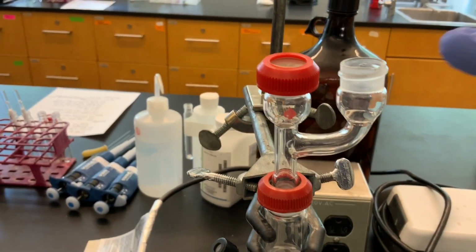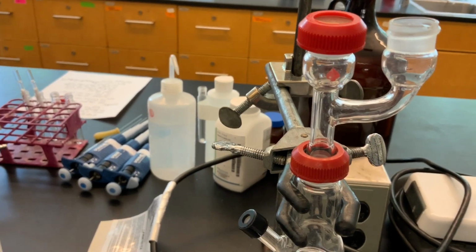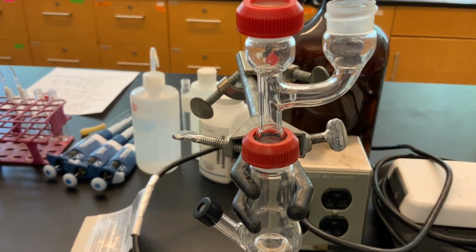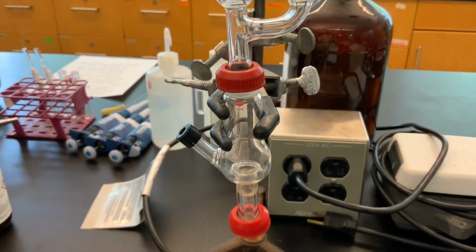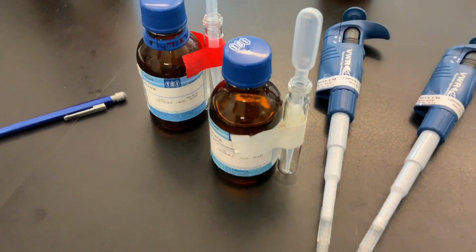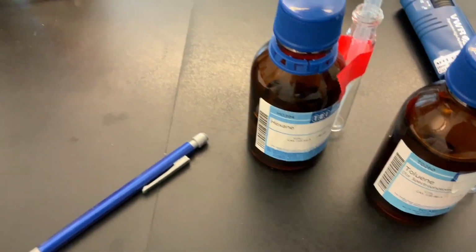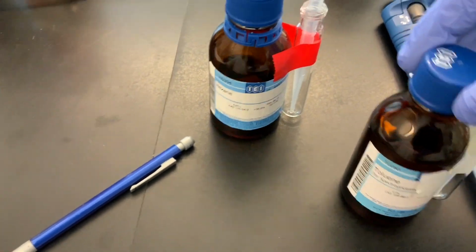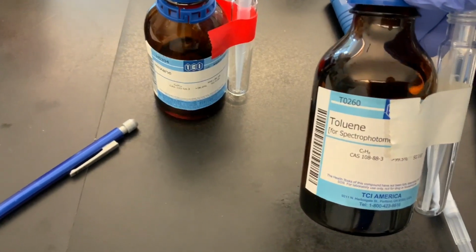The sidearm of the Claisen adapter will be left open to the atmosphere because, of course, we would never want to heat a sealed system. Otherwise, you could be making an explosion for yourself. Other than that, what we've got are 2 different automatic pipettes, and we've got pure normal hexane, only 1 isomer of hexane, the straight chain hexane, which is why it's called normal, and then we've got toluene.